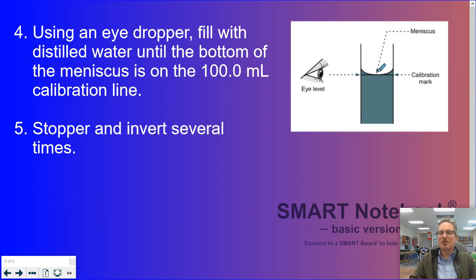What's really important about this is when we go to make this, you cannot spill any, you cannot splash any. If there's any air, if there's any bubbles in there when you're making it, tap the solution, get the air bubbles to rise to the top so that when you are finished, because this is a standard solution, this is the most accurate solution you can possibly make.